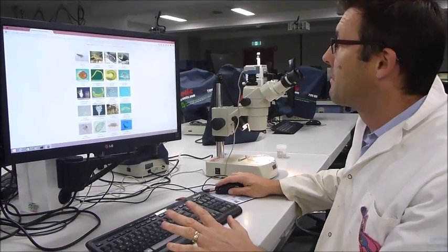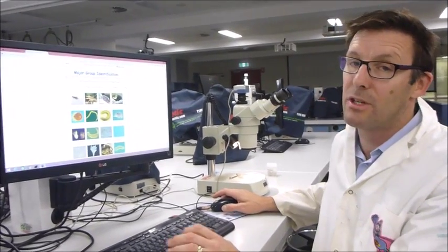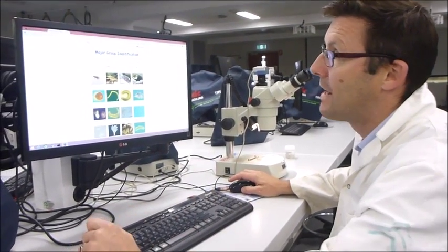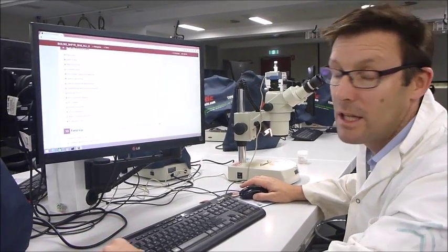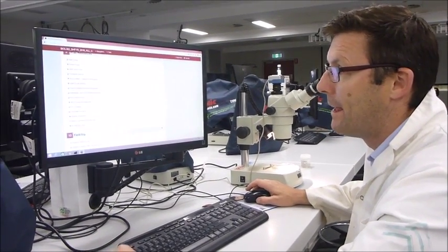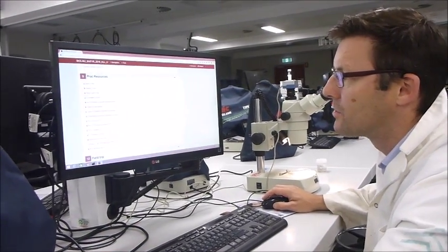Once I have finished analysing my samples, it's a good idea to get one of the tutors to have a look at what's on my list and to see that you don't have anything particularly bizarre. The next step is to enter your data for the class to use.